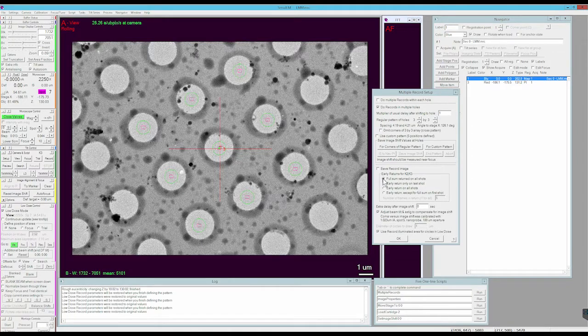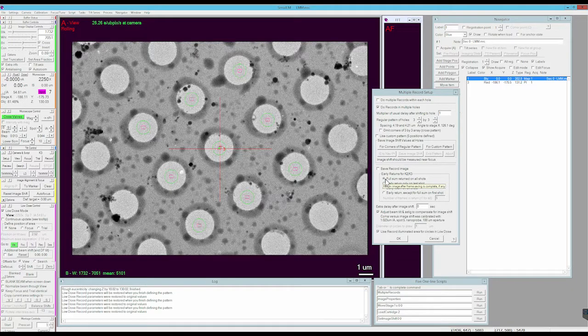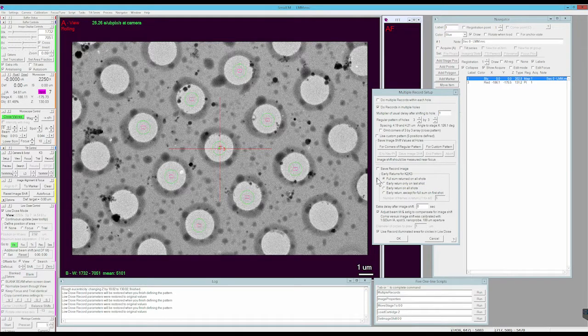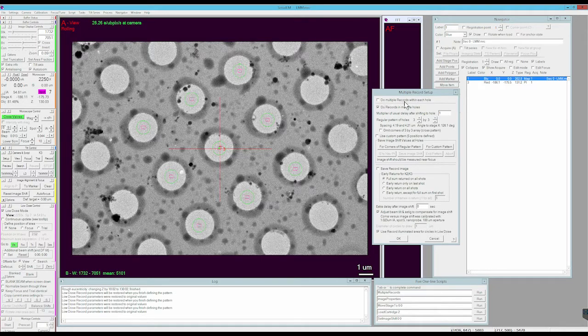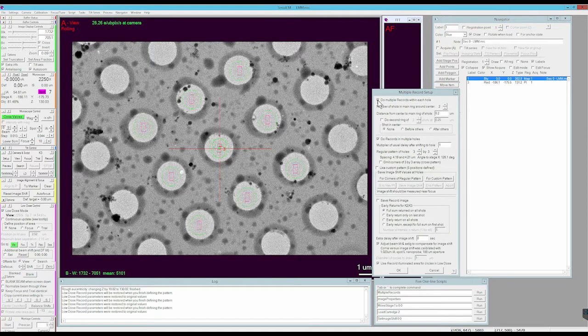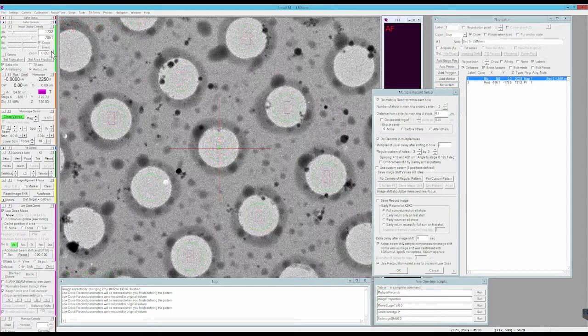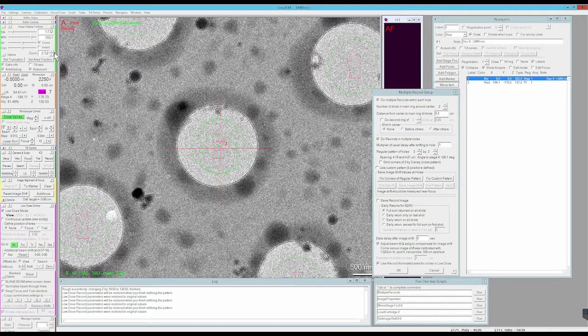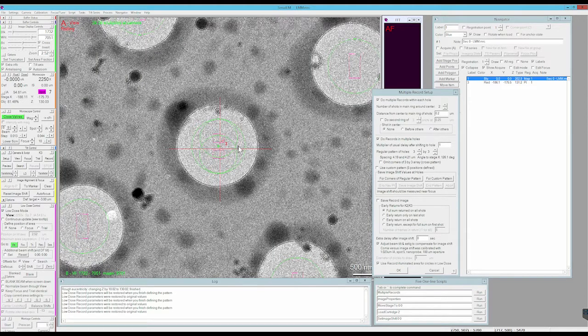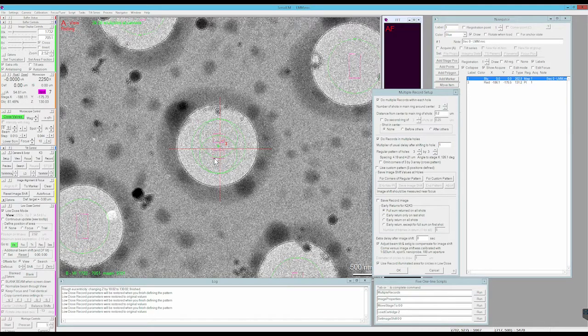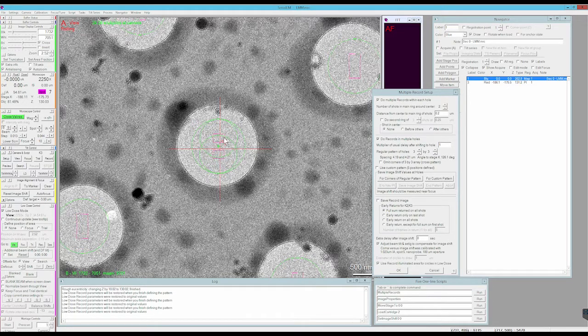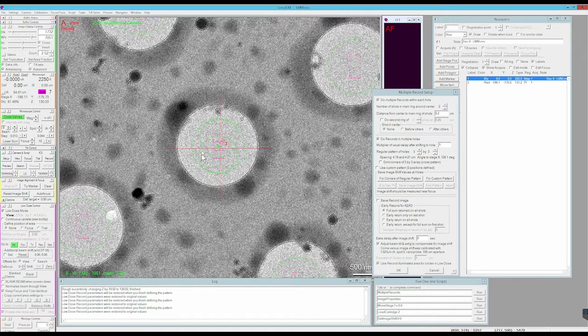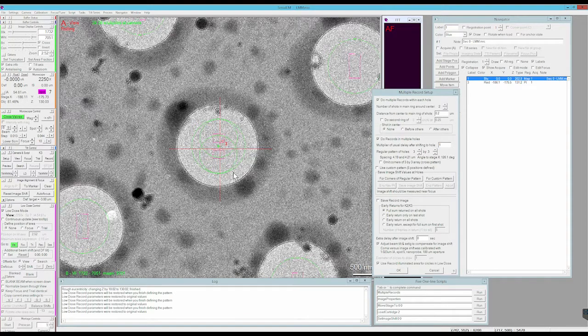If you're not and you're utilizing a high magnification like myself, which is 165kx, we can utilize another function in here that's just do multiple records within each hole. I'll select that and you can see when I zoom in that I now have two acquisitions.